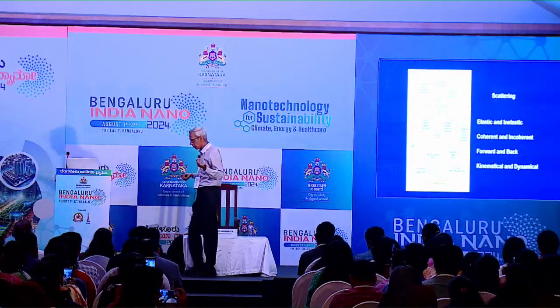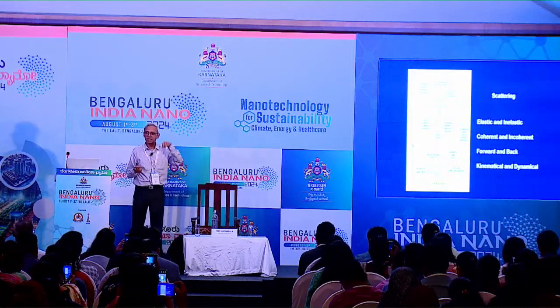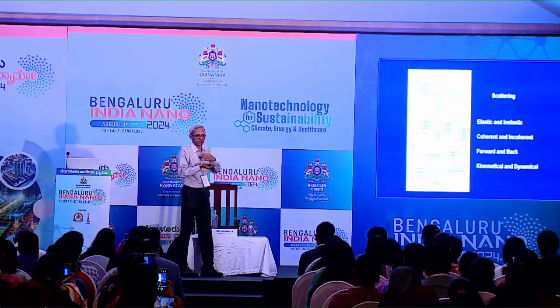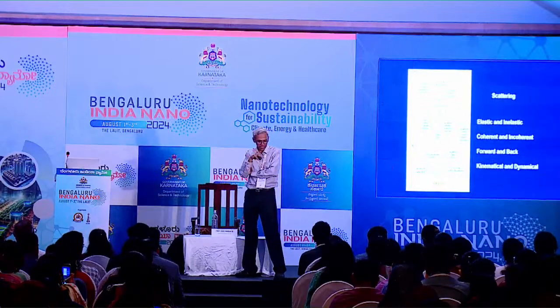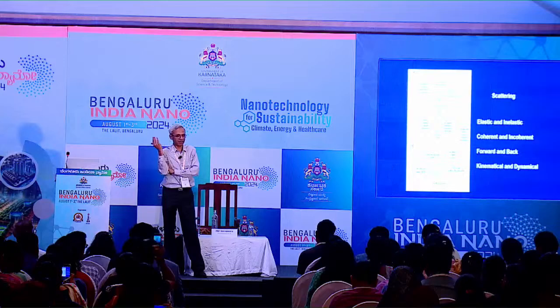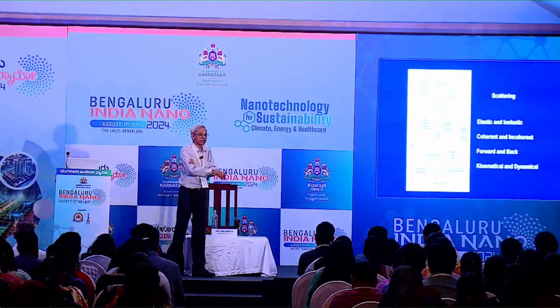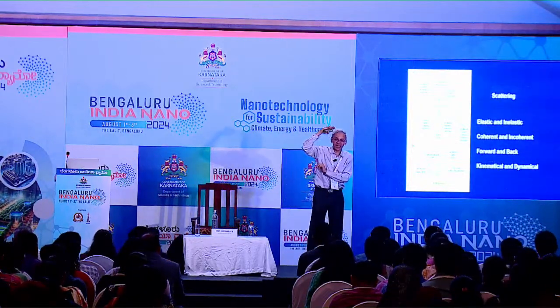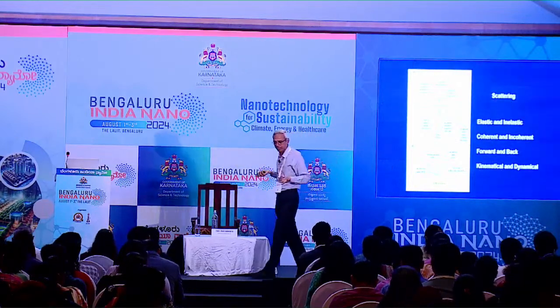Okay, so those are the important ones for which, like Bragg diffraction and other things, you have the same wavelength, same energy, they just undergo diffraction, and therefore you can actually get electron diffraction patterns and so on. Coherent and incoherent. Okay, when you talk of elastic, inelastic, they are using the particle nature of the electron, whether the particle is losing energy or not losing energy. Coherent versus incoherent, we are looking at the wave nature of the electron, whether the electron wave is scattering in phase or out of phase, or scattering randomly. So the coherent is scattering.